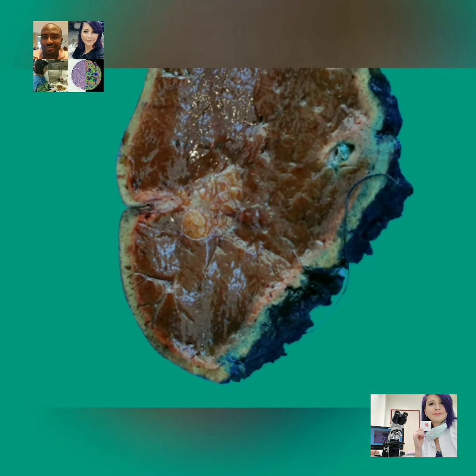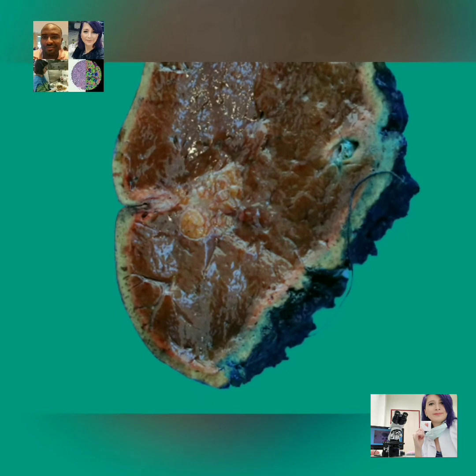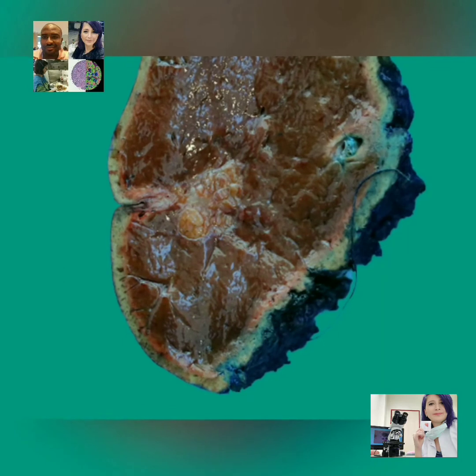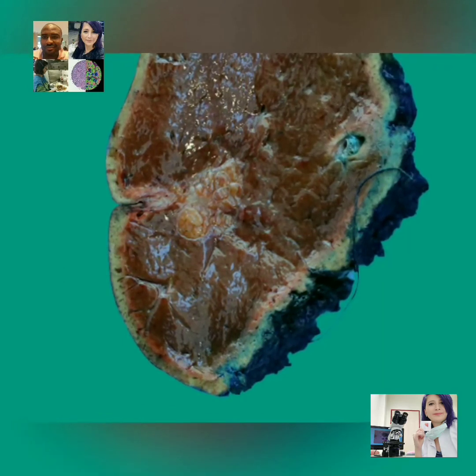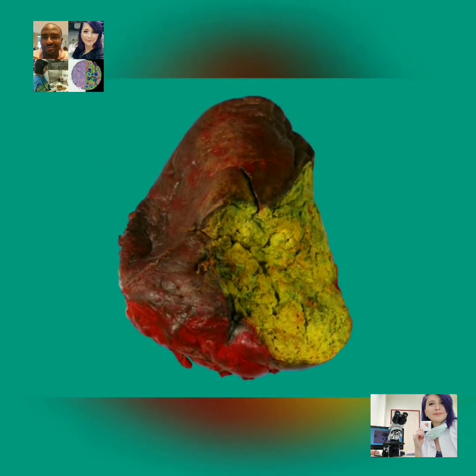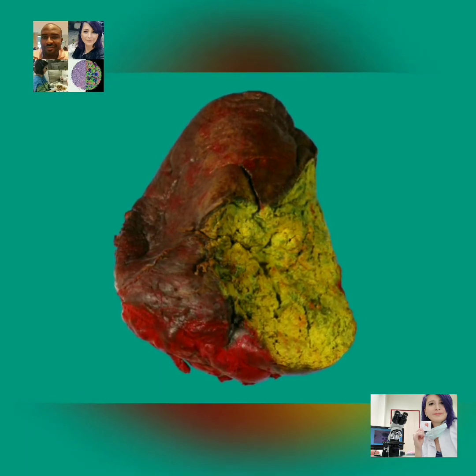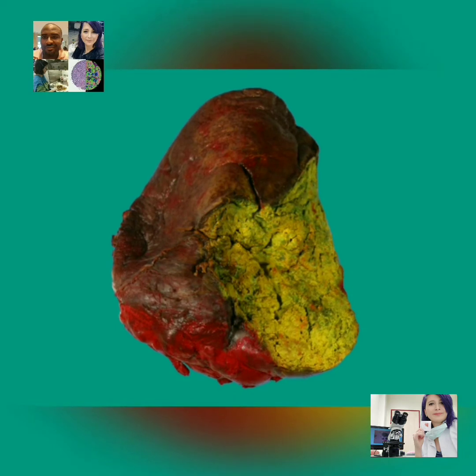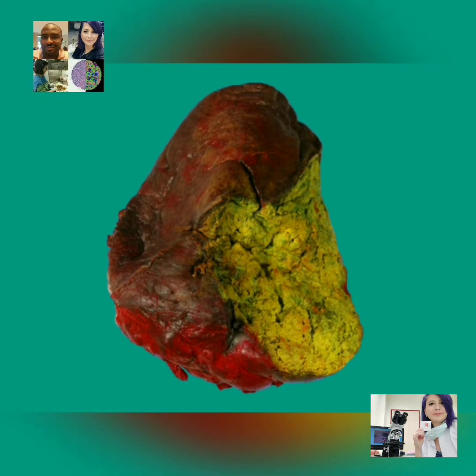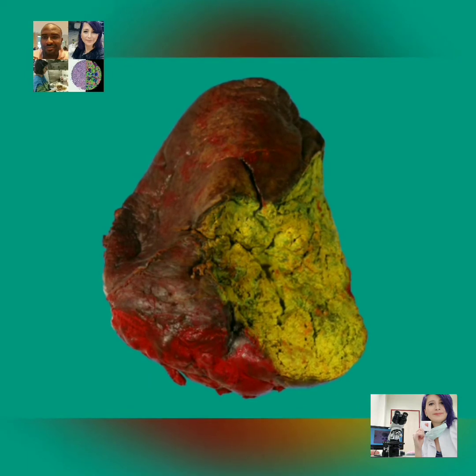Additional tests that may be done may include flow cytometry, cytogenetics, and molecular profiling. In the latter scenario, fresh tissue is placed in alcohol-based fixatives, as formalin, if used, will be associated with poor recovery of nucleic acids. The part of the biopsy fixed in formalin undergoes routine processing for H&E staining and for histochemical stains like iron, reticulin, and elastic tissue. The nature of the tests carried out depends on the nature of the disease condition, or it could also depend on whether the tissue is being used for research or a clinical trial is being undertaken.